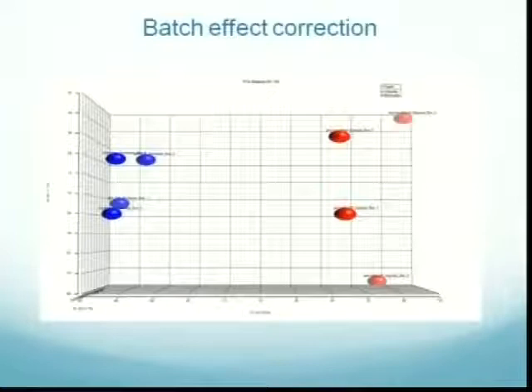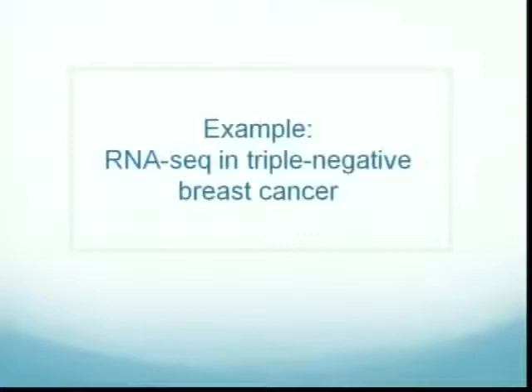All I'm saying is that if you're going to run RNA-seq studies, always do them together. Do your samples together as much as possible. And if you cannot, sometimes you cannot, then you have to balance. Don't put the blue in May and the red in December, because once you compare them, you don't know what is causing the difference. So always do it in balance. You may do some of this and some of that in December, and some of this and some of that in May.